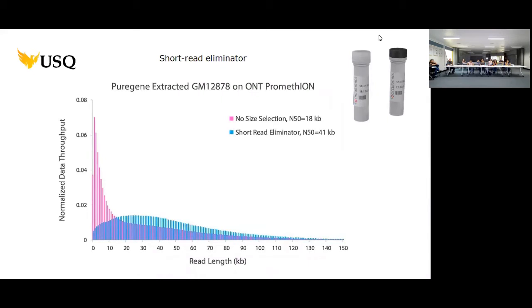This is really important, and you need to consider it in light of how much DNA you've got left as well. If you're getting right down to the bottom end where you don't have much DNA left, you may not actually be able to do this, otherwise you're not going to be able to sequence enough or get enough coverage out of it. If you've got enough DNA and you're going great guns, make sure you do this one, it'll make your life a bit easier.